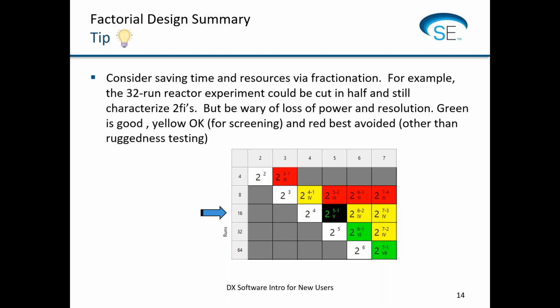And I think that would boil down to how important was it that we didn't miss anything. If you really couldn't take the risk, then perhaps you'd want to do 32 runs. If you felt that 77 is close enough to 80, then maybe you go ahead and try with 16 runs and see how it goes. Okay. In most cases, I would probably go ahead and do the 16 runs.